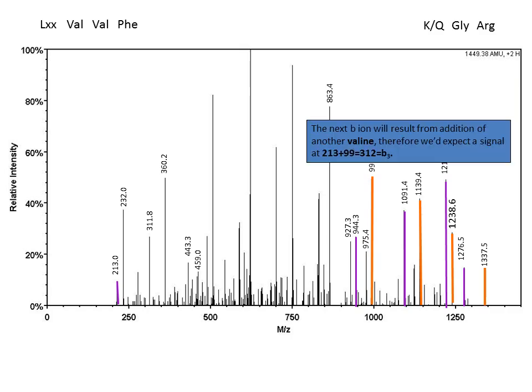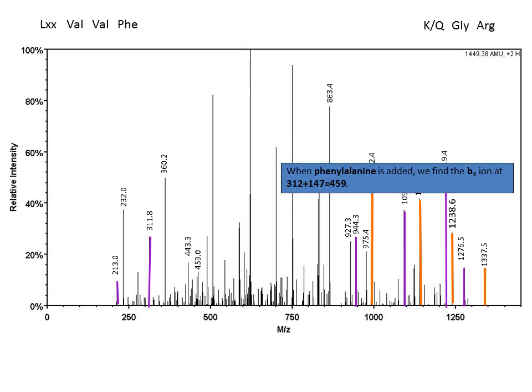If we then look at what we need for another valine, leucine, valine, valine, we need a mass of 312, which is also present in our spectra. Therefore, we can start walking up our mass range looking for ions that complement the C-terminal series.